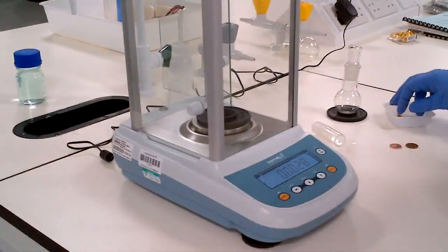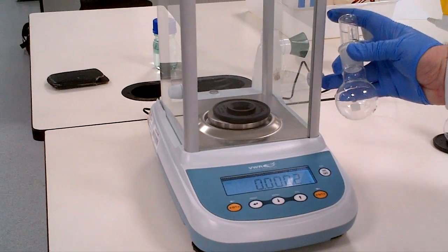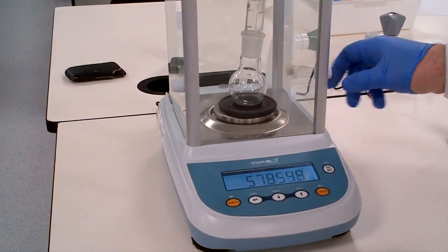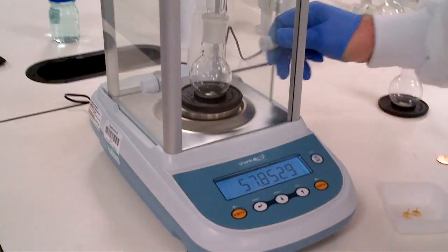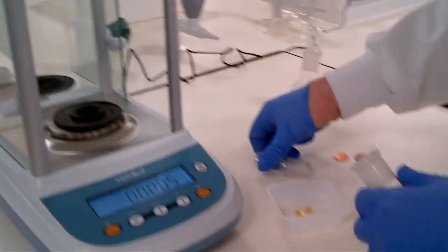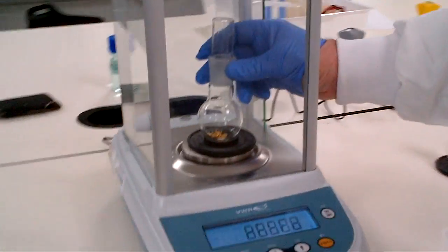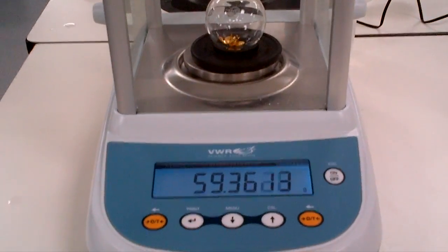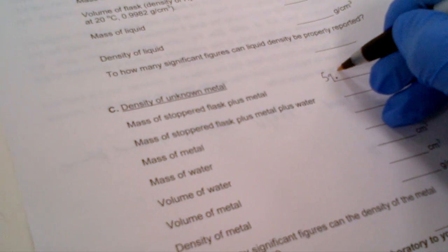We'll go back towards the balance area and make sure that's turned. We'll put the flask back on. We know the mass of the flask, it's what we previously recorded at the top line, 57.8437. So these are pins. Pins of course can be sharp on the edges. Be careful that some of the pins might still have some sharp edges towards them. Just take 5 pins, put them in there, weigh them. So this gives us mass of stoppered flask plus metal, so 59.3620 grams.